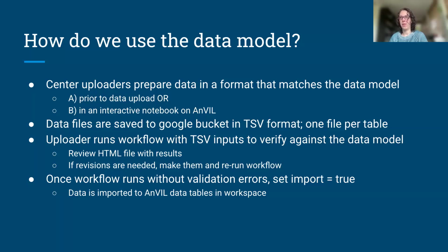And then if they need to make revisions, then they'll work on that and rerun the workflow and iterate as many times as necessary until the workflow succeeds. And we'll take a look at what that report looks like in a few minutes. And then once the workflow runs without any errors, then they can set the import flag to true and import all of the data to the data tables in the AnVIL workspace.